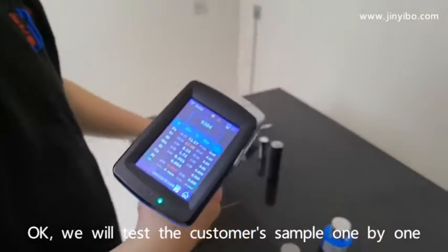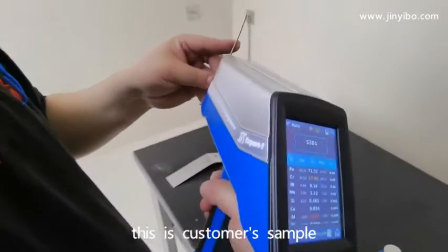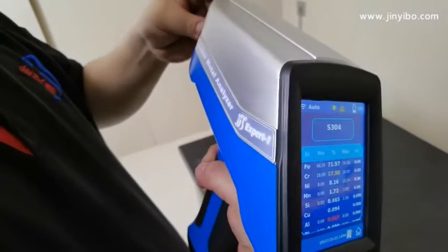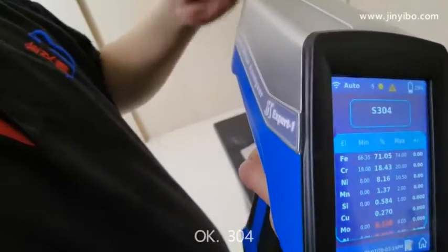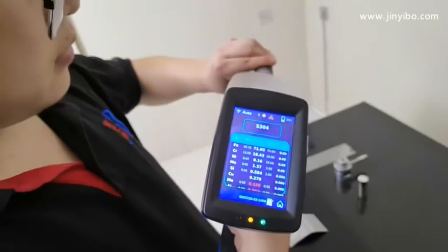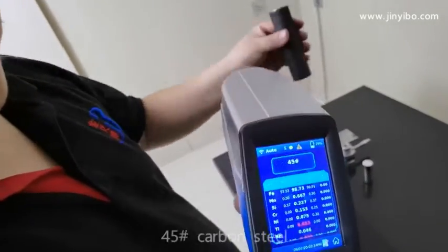Now we will test the custom samples one by one. Test the custom sample. Okay, 304. 45 carbon steel.